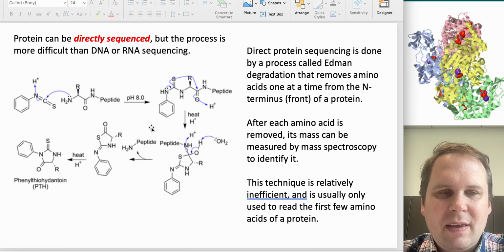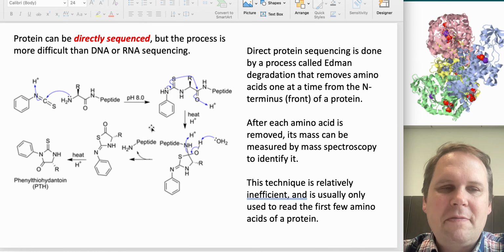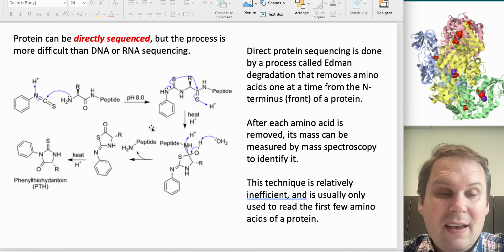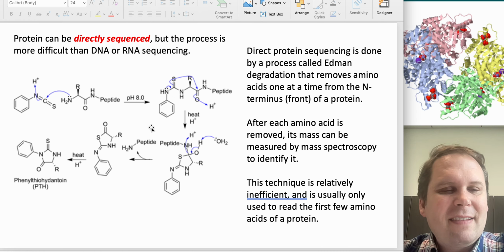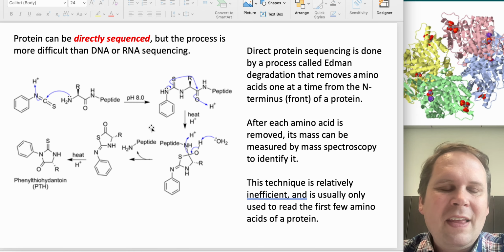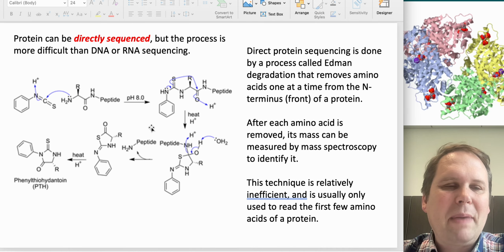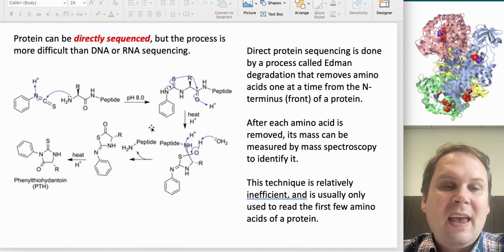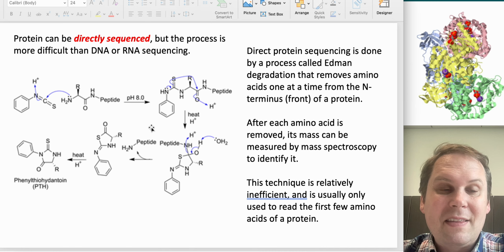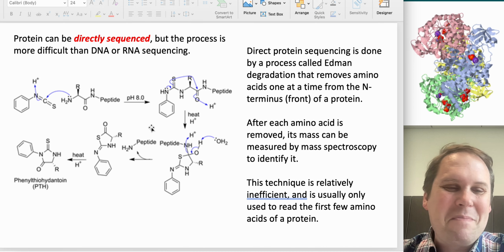And so, congratulations, you've broken off some amino acids, but then the follow up is that you do mass spectrometry, which is basically a way that you can measure the mass of different molecules. And so you'll throw this thing basically at the wall. It's like if you had a ping pong ball, so a little hollow ball, and let's say a tennis ball, and let's say a baseball that's sort of hard and heavy. If you throw these things just with your arm, which one's going to go fastest? The ping pong ball is going to go kind of slow because it has very little mass and it may not even make it to the wall.